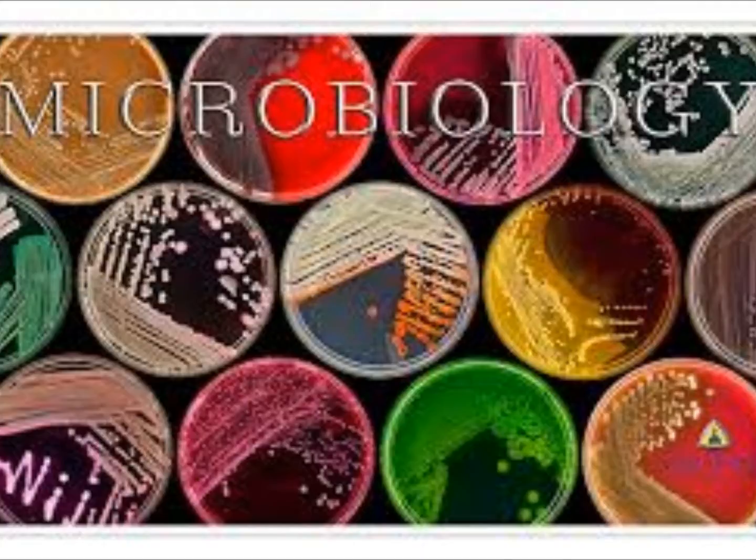Then look at your colony on the blood plate. Can they at least do G or NG all the way across? G is the acronym for growth, NG is the acronym for no growth. In your case, we could have her put G on the CNA and the yeast, but since she doesn't have it yet, just put a line right now, or put NA for MAC and CNA, because you don't have it at 24 hours.